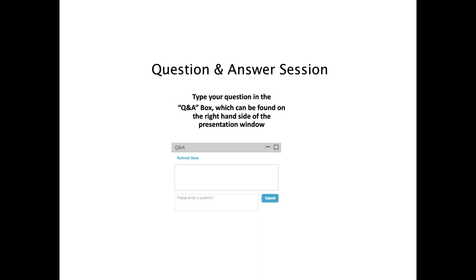So our experience has been that series detection is always much more robust, and as we tried to demonstrate in the webinar, the dispersion that you get is very low with the system. So the benefit that you might get from parallel detection would be very modest, and the downside, of course, is if the split ratio is not very well controlled, you actually introduce shifts in the arrival of the peaks between the various detectors. So we don't recommend parallel detection.